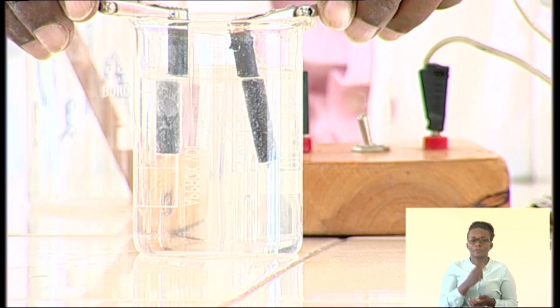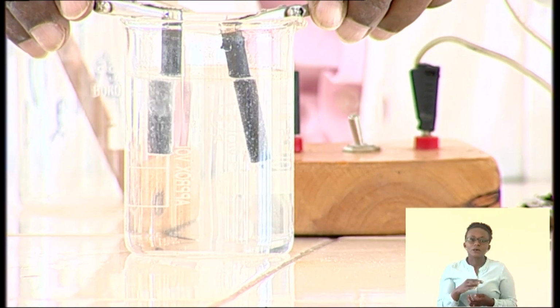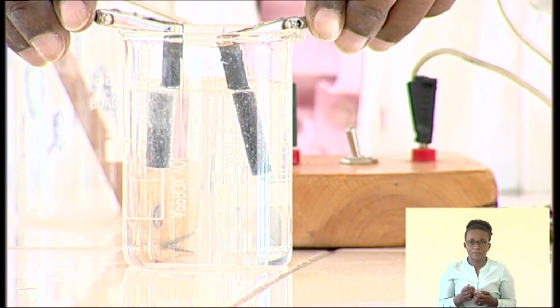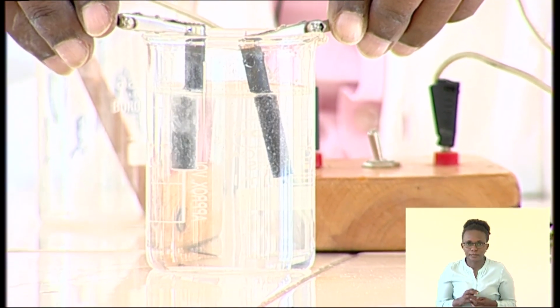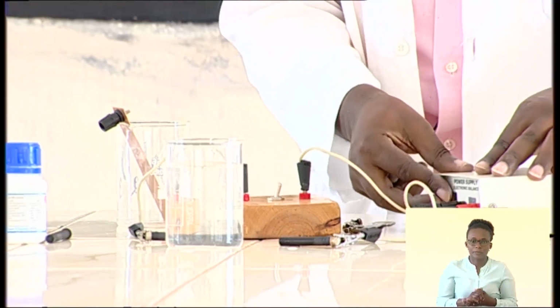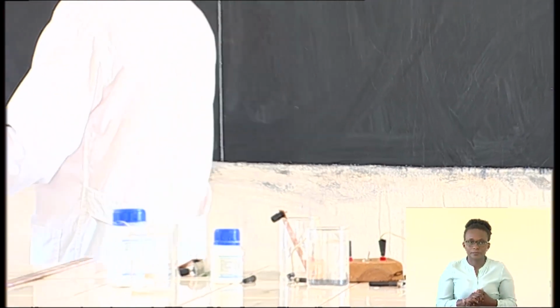And which are these gases? This is a dilute solution of sodium chloride. A dilute solution of sodium chloride. So I can switch off. Once I switch off, we are just going to see what is happening.